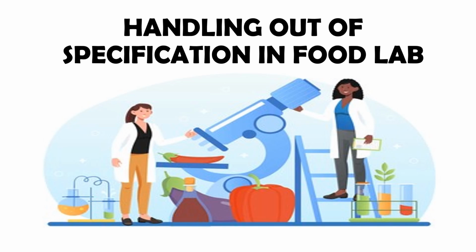The purpose of this video is to provide guidance on investigation, determination, and documentation of any OOS, that is out of specification, that was obtained during testing of a result.